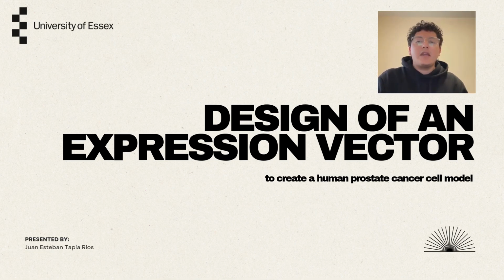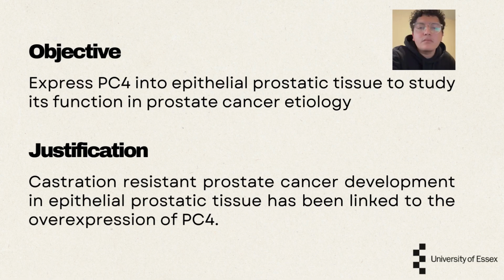Design of an expression vector to create a human prostate cancer cell model. What is the objective? The objective is to create an expression vector to express PC4 into epithelial prostatic tissue to study its function in prostate cancer etiology.